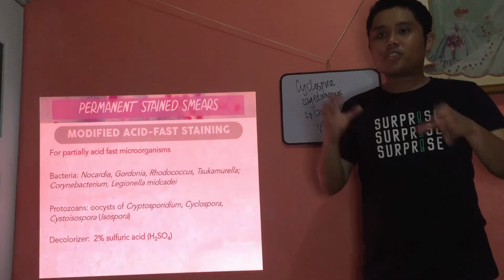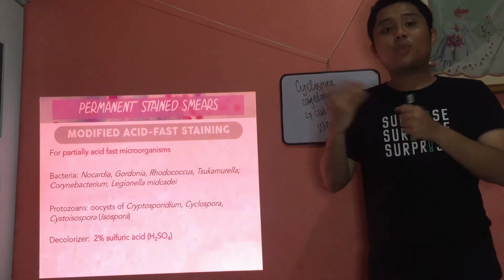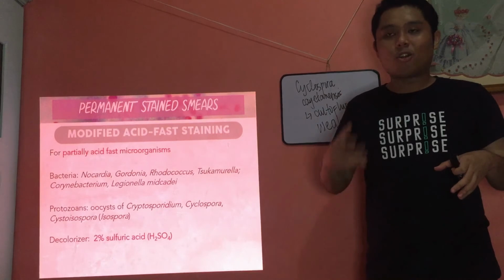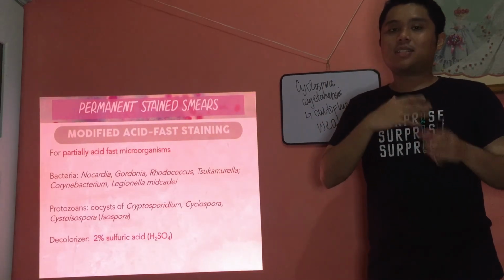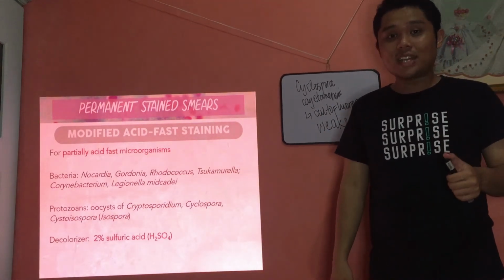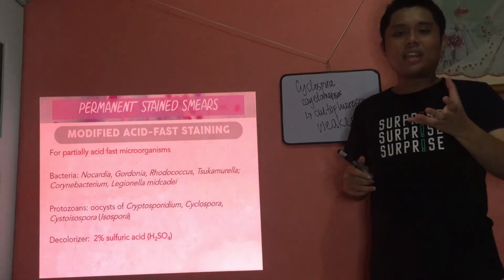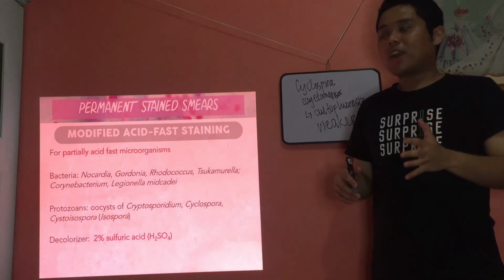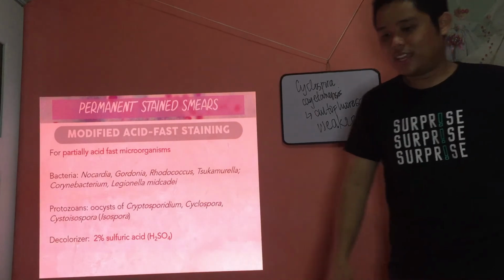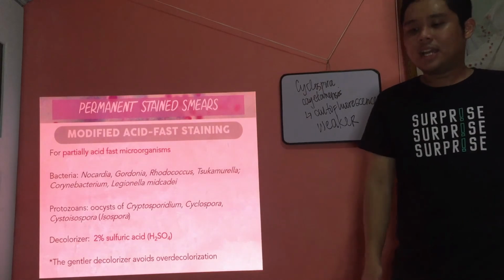So instead of using the stronger decolorizer that is used in the true acid-fast staining procedure, we just use a weaker decolorizer to compensate, okay, or to match their small content or low content of long-chain fatty acids in their cell walls. Okay? Alright, ayan. So that's why it's called modified acid-fast. Why is it called modified acid-fast? Because it uses a weaker decolorizer, less concentration, than the true or original acid-fast staining procedure. Okay, ayan. Gentler decolorizer avoids over-decolorization.